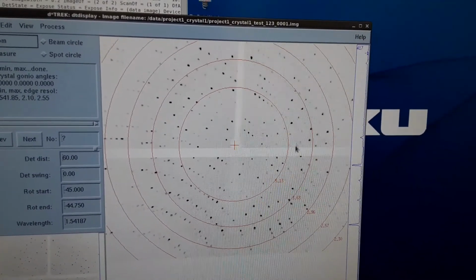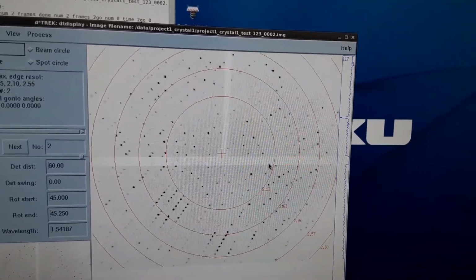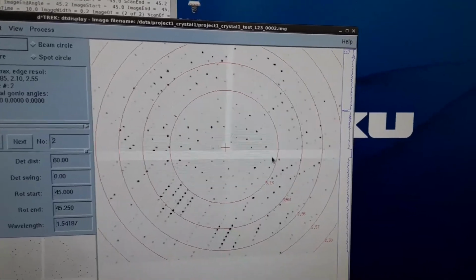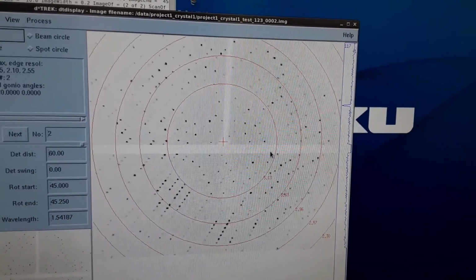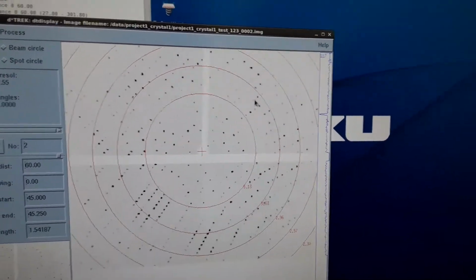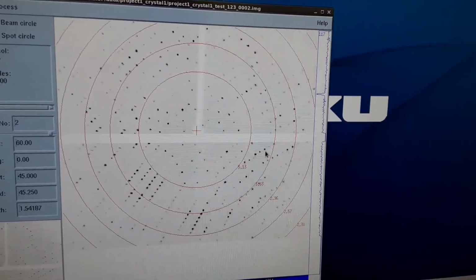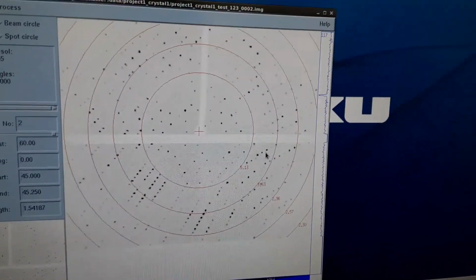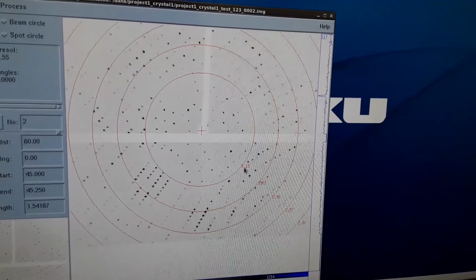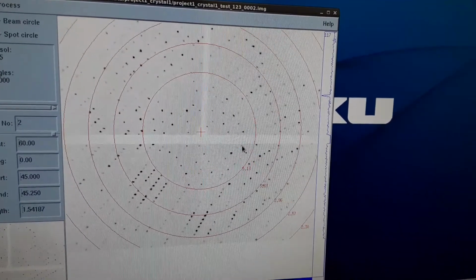So a couple things I want to point out. There's a white space in the middle of the detector, and there's a second image at the 90 degrees. So again, that image diffracted very nicely, and this is a very good crystal. This white space in between the two, in the middle of the vertical part in this detector, it's actually 2 detector chips, and we can see one detector chip on the top half and one on the second half.